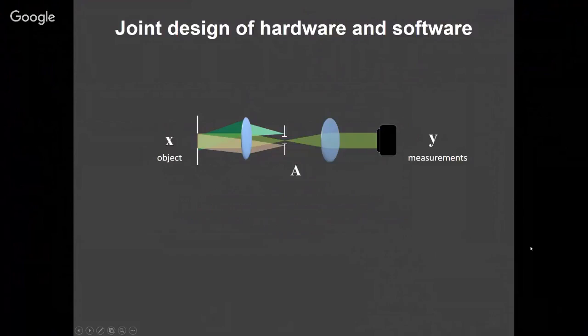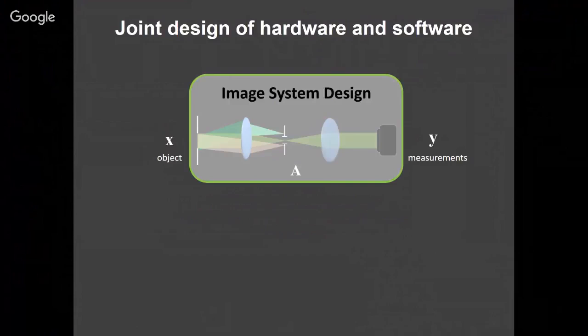It can be linear or nonlinear, whatever, but you get to design it within physical constraints and cost and complexity considerations. So this is the imaging systems design part of it, and it's more like a black art, right? You have to think about what's the best way to transfer information from X into those measurements Y without having a system that costs $1 billion or is physically impossible.